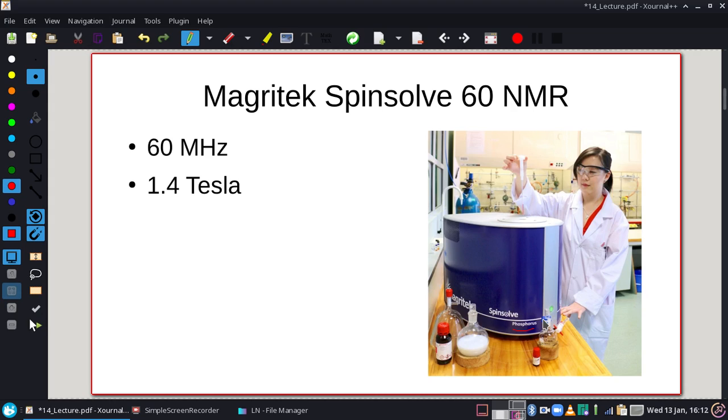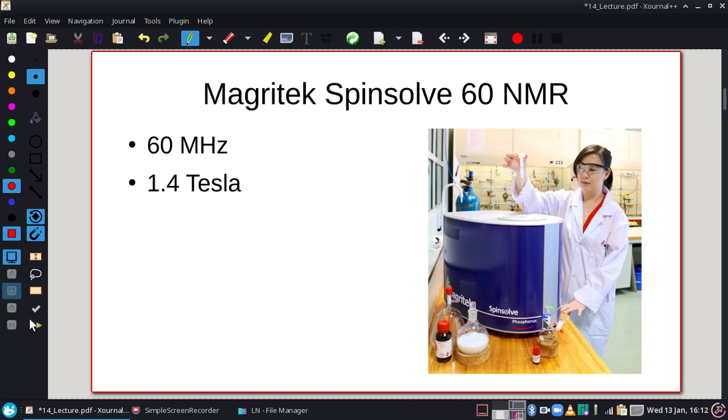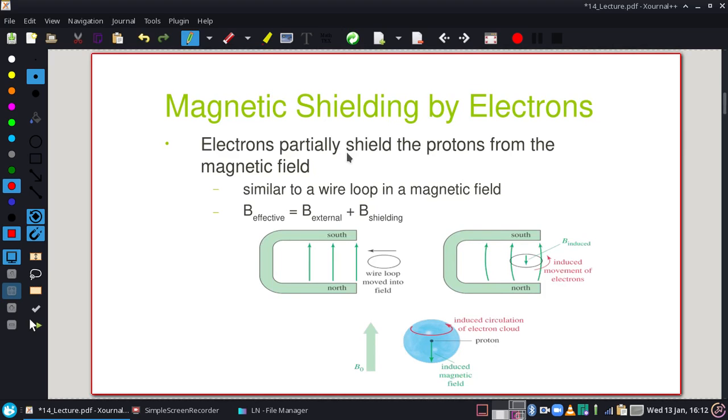All right, now here's where this comes in handy. The reason an NMR is so versatile is that frequency I was just talking about, so that maximum frequency of 60 megahertz, that's that ballpark range for where we would find the average hydrogen in that particular field. But that average hydrogen would be a hydrogen that's maybe surrounded mostly by things that are equal in electronegativity.